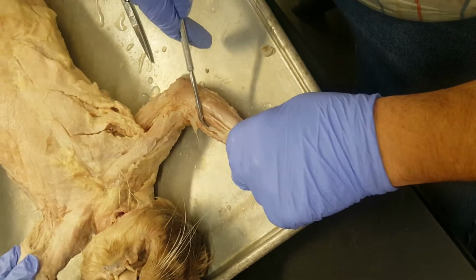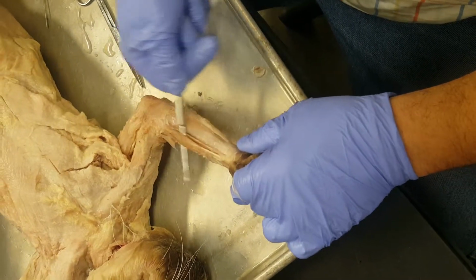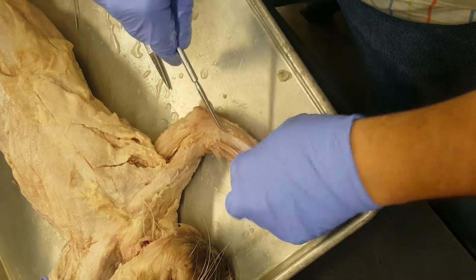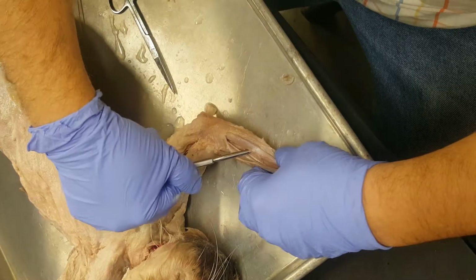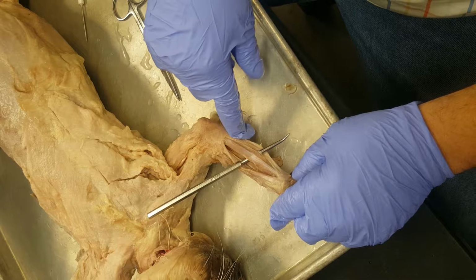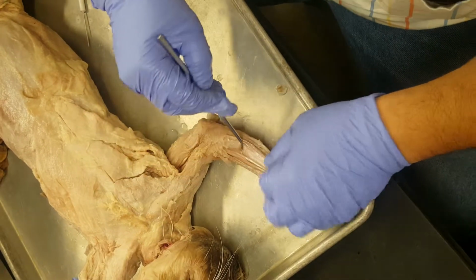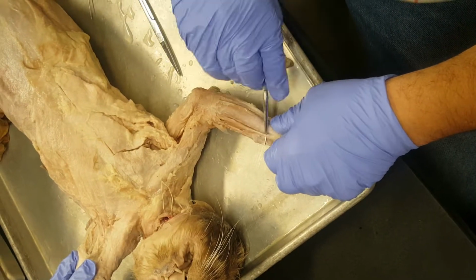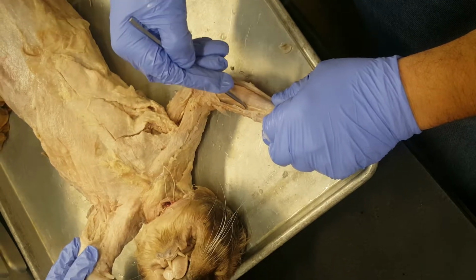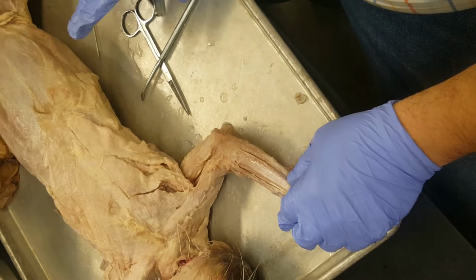Okay, the little thin one over here on the edge is your pronator teres. Then you have your flexor carpi radialis. Then underneath the palmaris longus, all these are your flexor digitorum superficialis. And then we move it over this way. This big one here is your flexor carpi ulnaris. So it goes ulnaris, flexor digitorum superficialis underneath the palmaris longus, and it's flexor carpi radialis, and then pronator teres is this little one here. It's kind of flat and becomes membranous kind of down here. Okay, that's what we've done so far.